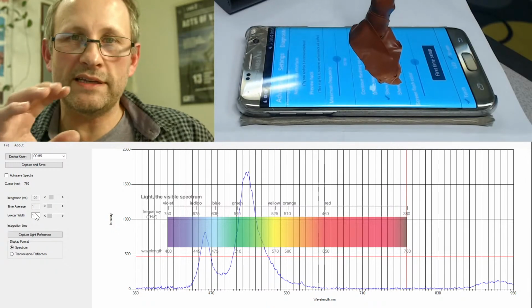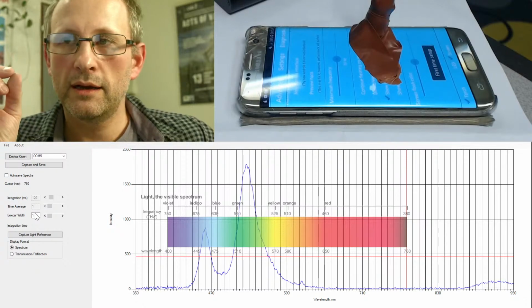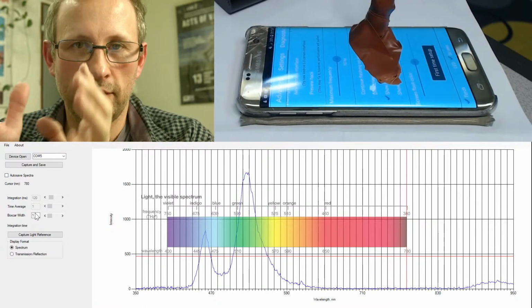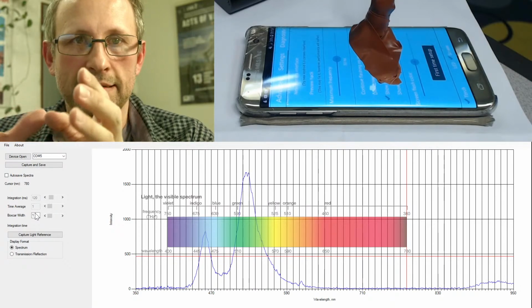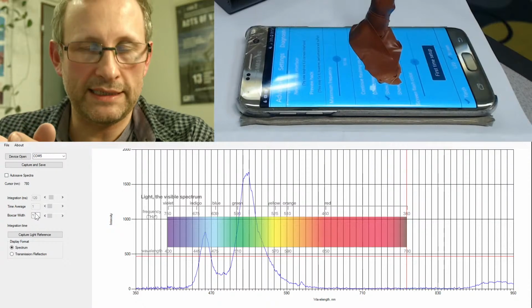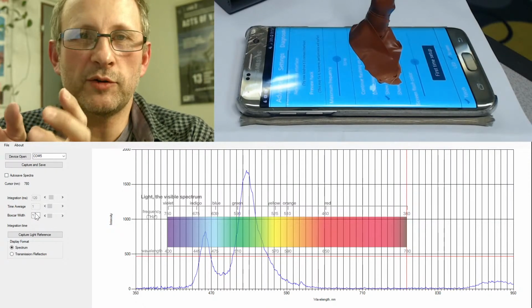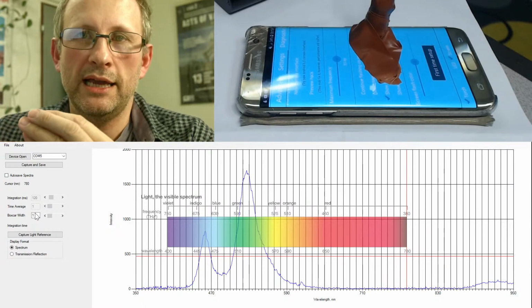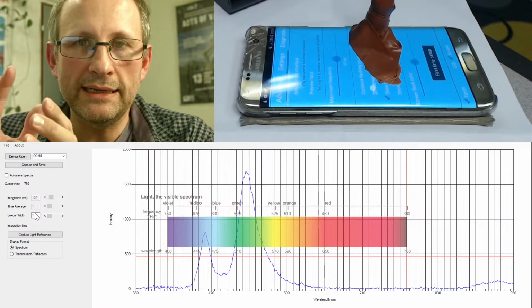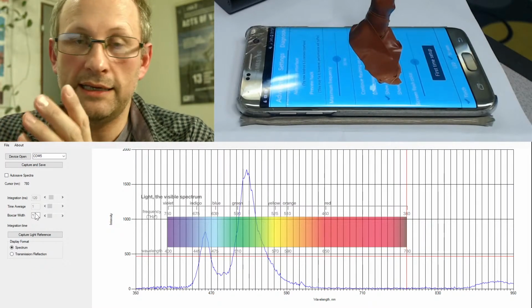So when I bought this on Amazon, and it's from California, from the Bay Area, you paid extra. I can't remember what it was, but the device was $399, then you paid tax and shipping and import duty. But they were very good that they bundled everything together, I think it was Amazon's global shipping service, and so all the tax that you would pay into your country is already sorted out, and so it was like pay one figure and then it just turned up.